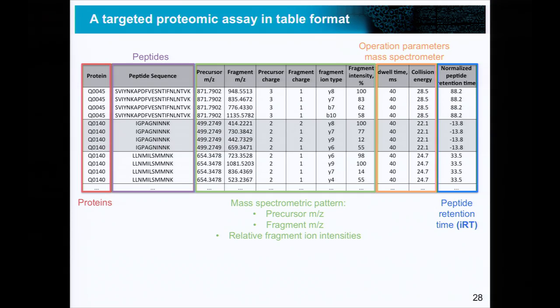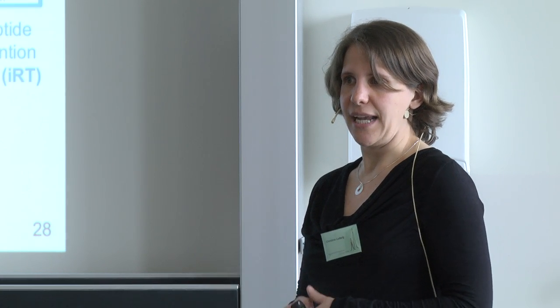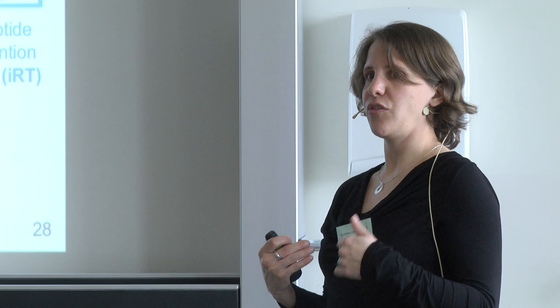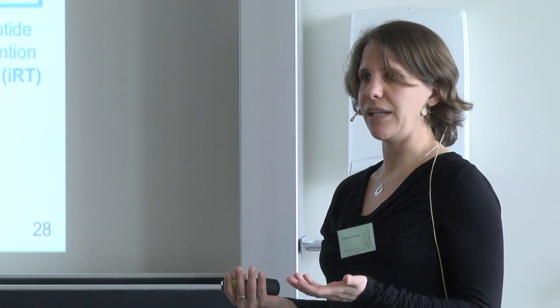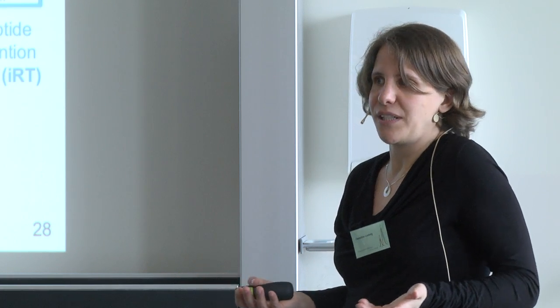And here Ariel will talk a lot about this this afternoon, so I don't want to say too much about it. But if retention time is provided in an SRM assay, it makes, of course, not a lot of sense to store it in units of minutes or seconds. Because if I can measure a peptide at 15.5 minutes on my instrument, on your instrument this can be a very different retention time.